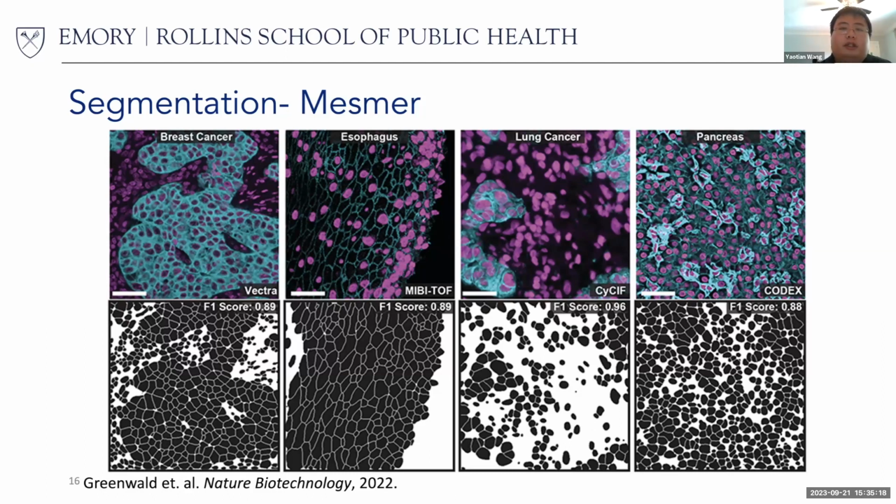Then what about nuclei and the size of nuclei? How big are they? Yeah, that also depends on the cell. You have some cells that are relatively round, and you can just think about identifying the nucleus, which is easier than identifying the whole cell, and then just drawing the cell or some radius beyond the nucleus. Those are easier problems, but there are also other types of cells, like neurons, for example, that don't have a round shape. So segmenting those is a lot harder because they have little arms that go off into space, and it's hard to know where they start and end.